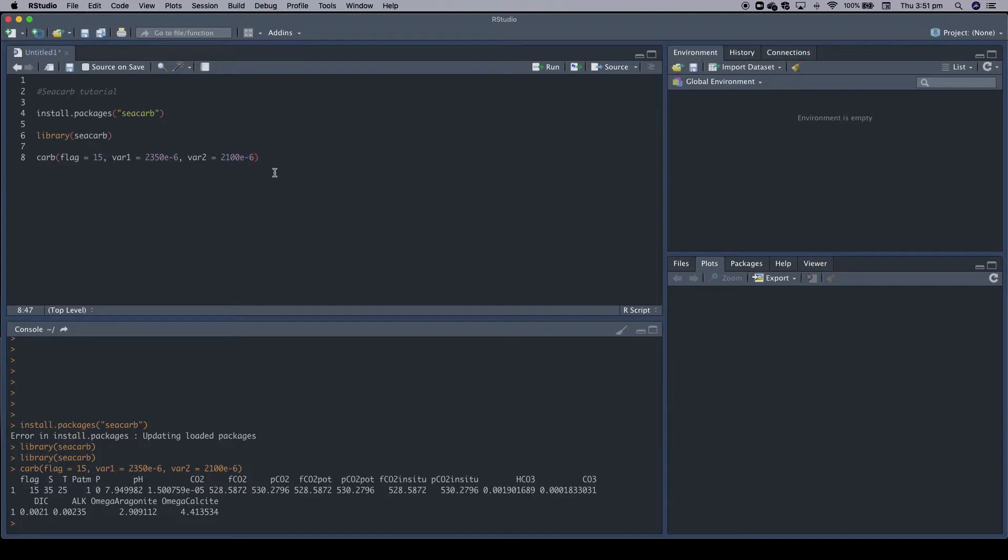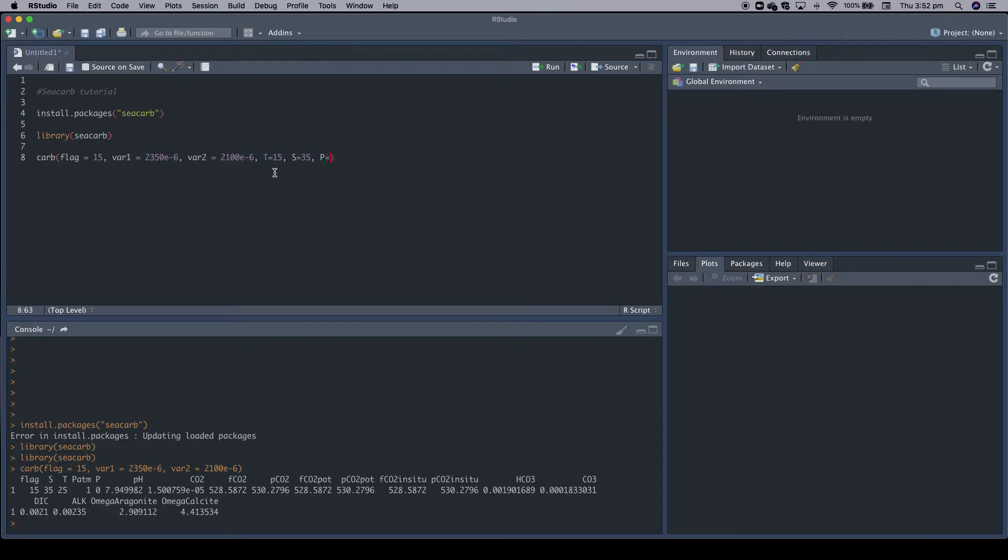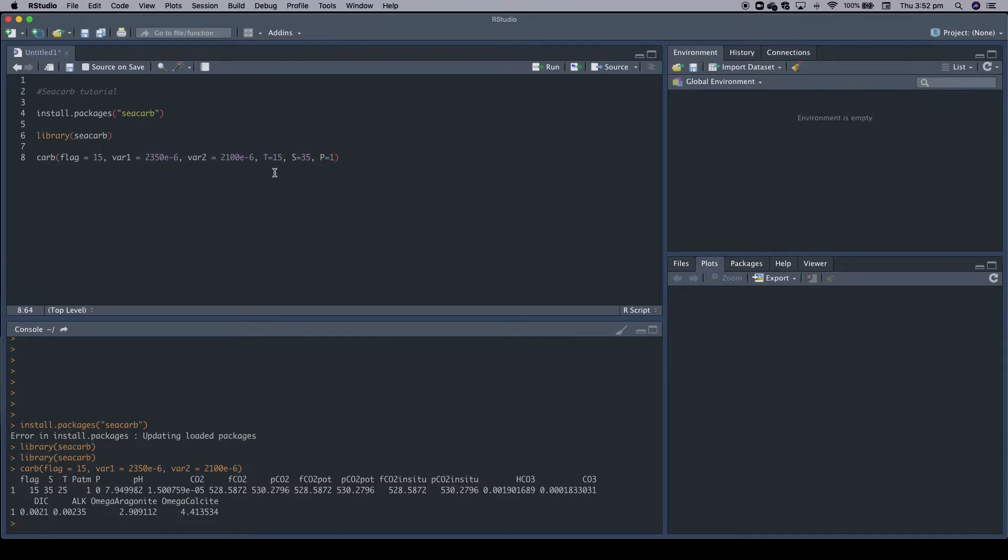But in most cases, these default values do not match the conditions you want to calculate the carbonate system for. So you need to specify some additional input variables. For example, temperature. You simply add a temperature in degrees Celsius, for example, 15 degrees Celsius. You add a salinity - typical ocean salinity would be 35, which is also the default value. Then you need to add a pressure, a hydrostatic pressure, which has the units of bar. So if we want a surface ocean, we would have zero hydrostatic pressure. And if we want to go to, let's say, 10 meters, then we would have approximately one bar.